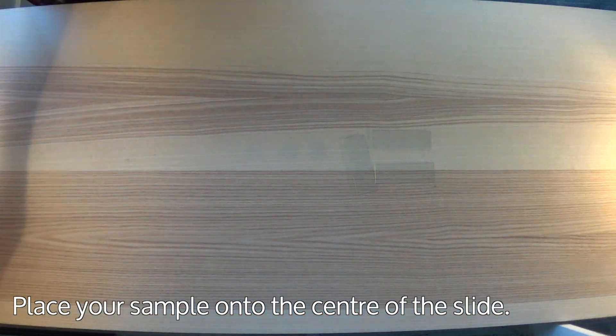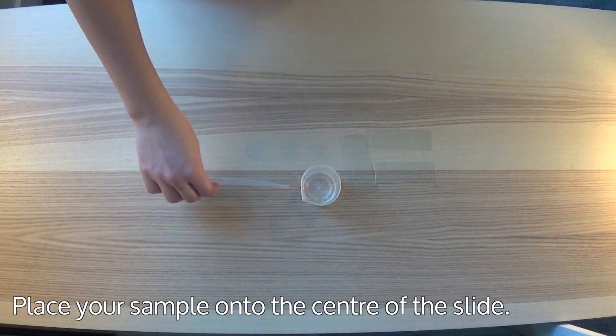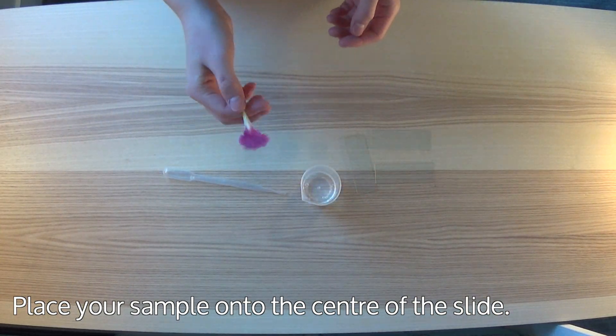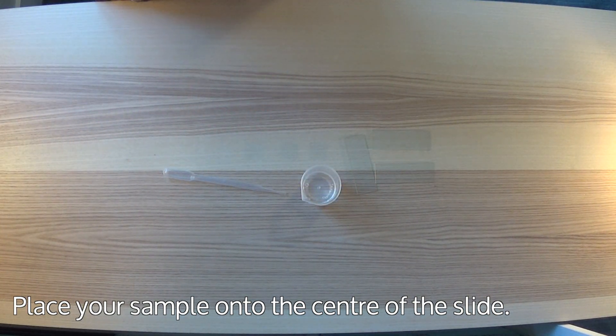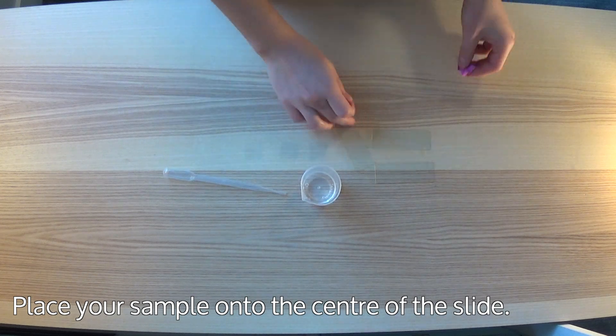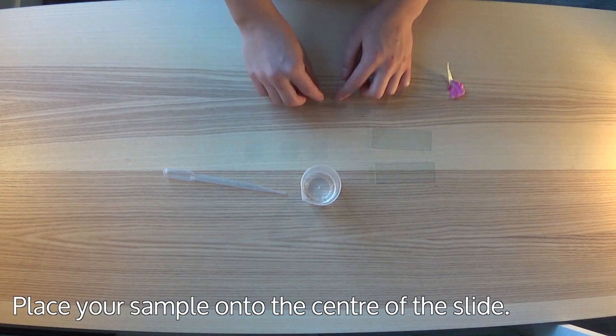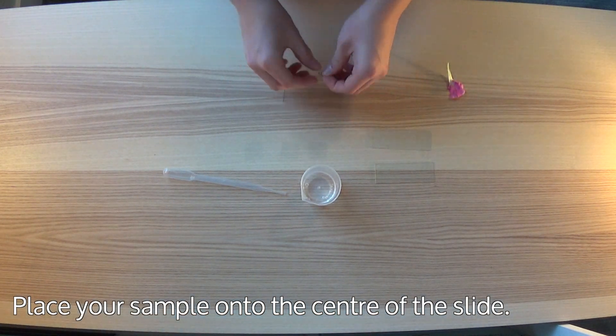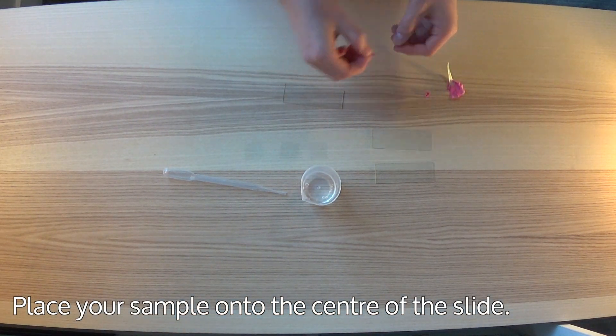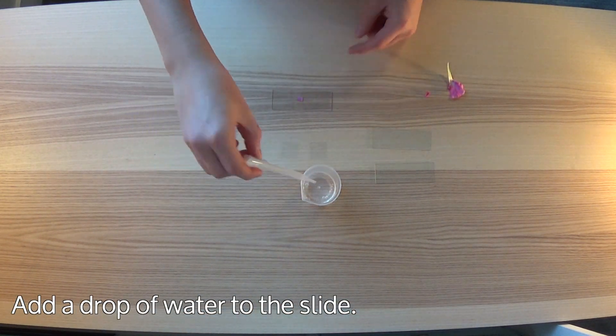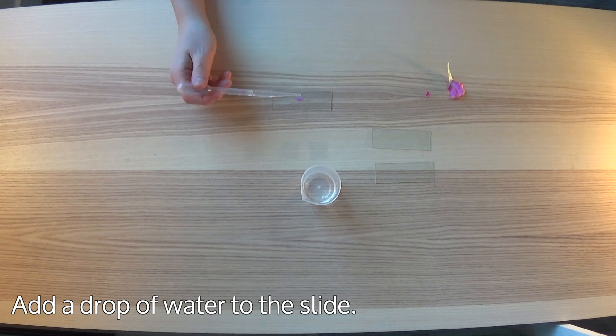Place your sample onto the center of the slide. Add a drop of water to the slide.